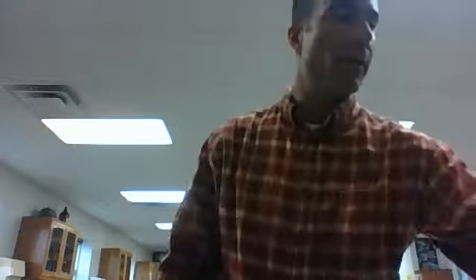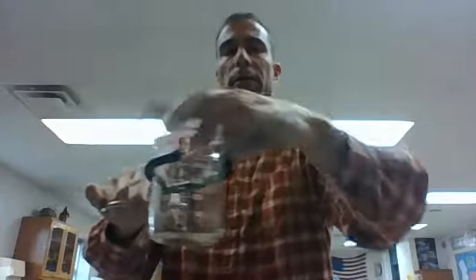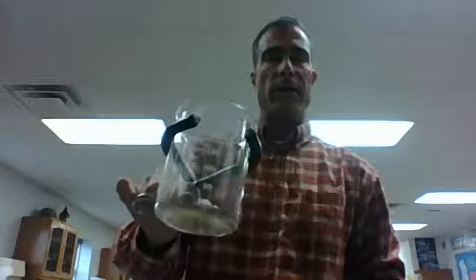Our next item is tongs. Beaker tongs. We use these to carry around beakers that are very hot, so we don't touch them and burn our hands or anything like that. So this is a beaker tongs, okay, for safety.